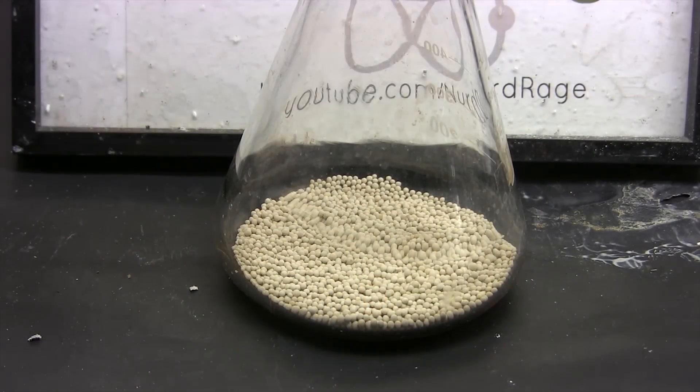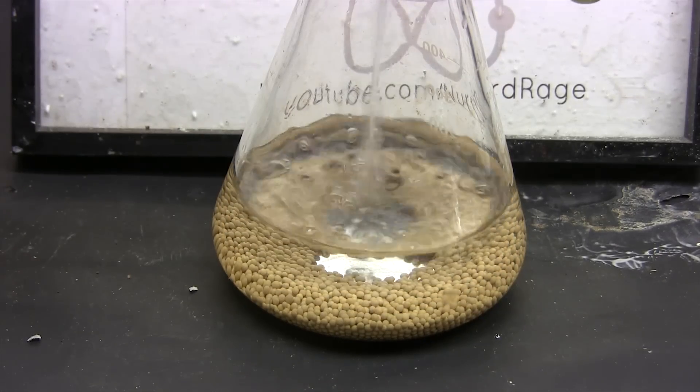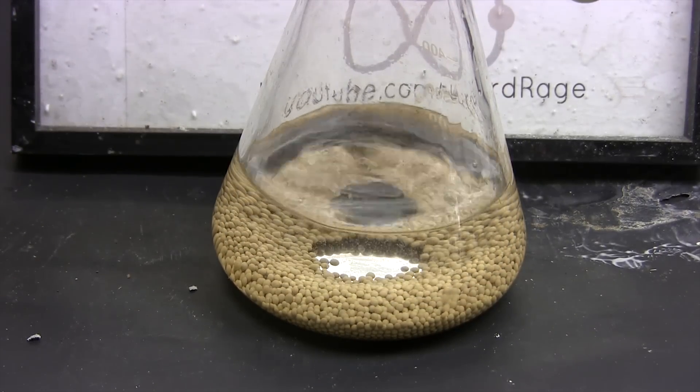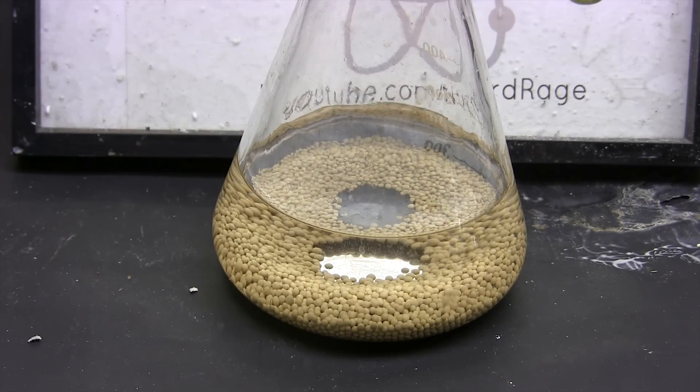In a previous video I showed that we could use molecular sieves to dry alcohol, and some have asked if that could be used for Fischer esterification. Unfortunately we can't add the molecular sieves directly because the acids in the reaction would destroy them.